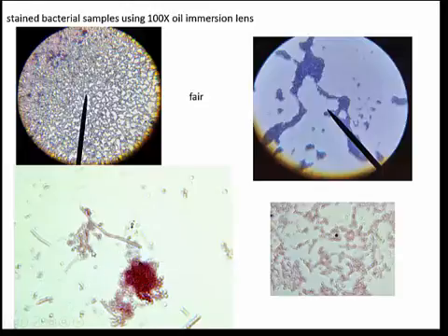And here we see individual cells, we see clumps of cells, and then this also is probably a long bacillus cell. So long bacillus, and then down here we've got coccus or coccobacillus, and this is another bacillus right here. So these are fair. Those are passable. If you get images like that and that's the best you can get, submit it and you will certainly get points, and you should not be unhappy with them.